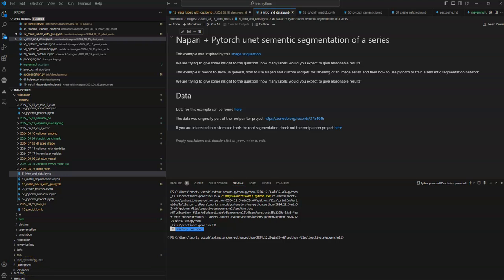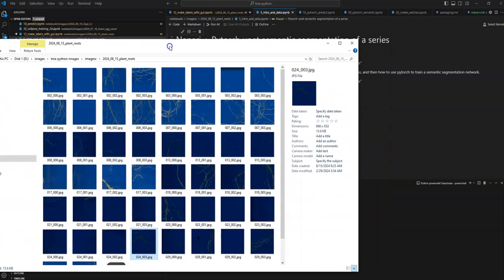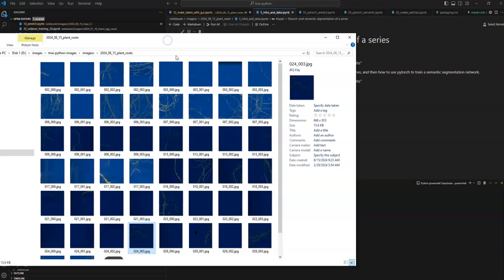Hey, so new video, once again inspired by the ImageSC forum. So there's been a few questions the last few months which basically are about semantic segmentation. So basically, people want to segment like a vessel-like or root-like structure.